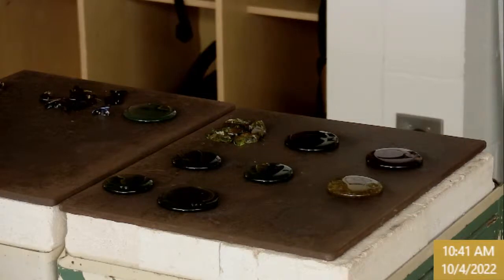Now, he also mentioned the box. We're gonna get it in the box. What's that mean? Well, this is hot glass that still has lots of tension inside, and to make it stable, unlike what we're doing, we're cold quenching this glass on a piece of metal. We're just letting it chill to room temperature quickly.